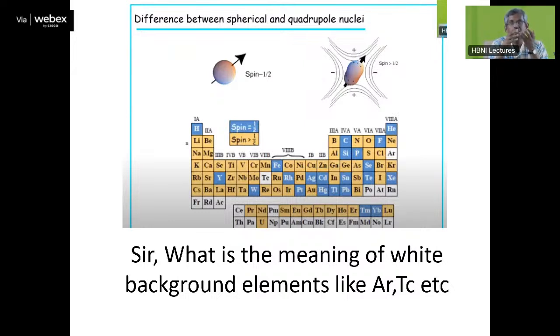So far, if you see in the literature, for example argon NMR, I don't think you can find it. At least I have searched the literature, and we cannot find it. Similarly, polonium is radioactive, so we cannot see it. Some of them are actinide elements like americium, curium, berkelium, etc. They are really radioactive and it is not possible to do NMR. Of course, people have not tried, and you cannot find it in the literature. Some of the isotopes are not NMR active, and due to radioactivity we cannot do it.